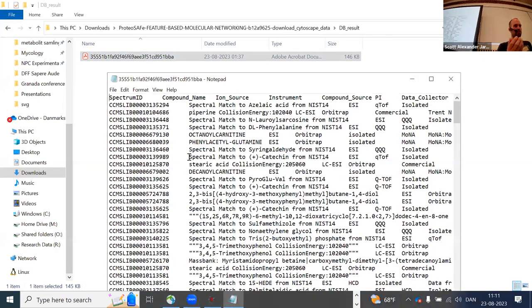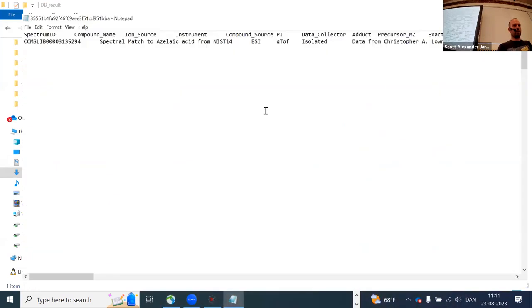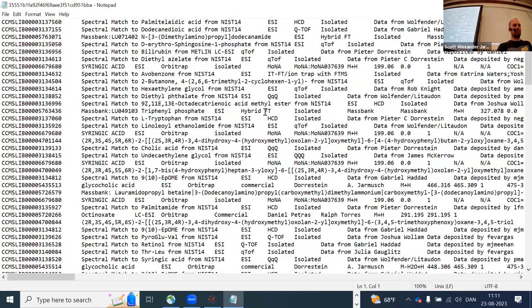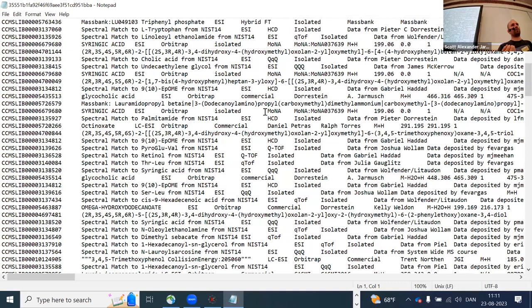And then I would get, again, this long list of the IDs, the same way I had it in the web browser. The difference is I don't have this interactive visualization of the mirror plots, which I think comes very handy in the online tools that I typically use. But obviously here it's much easier now to filter and handle this data.